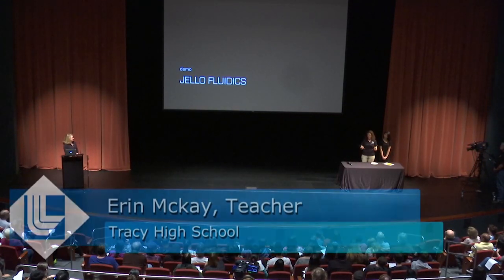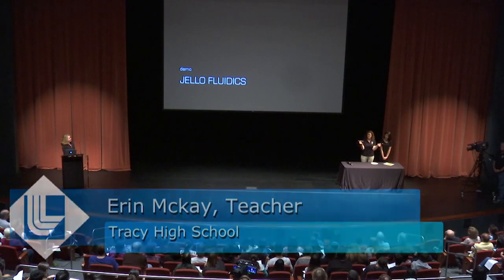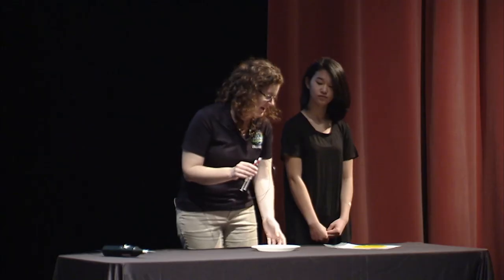Okay, guys, so we have two different dyes here. We have red dye and we have blue dye. Now, when we mix these together, what color do we expect to make? Yeah, purple. But if things go well, we should actually be able to put in the red dye into one channel and the blue dye into the other channel. And if we flow it through at the same rate and it hits the center point at the same time, instead of mixing together, they will flow side by side. But I only have one shot at it. Let's see whether we can get it to work or not.